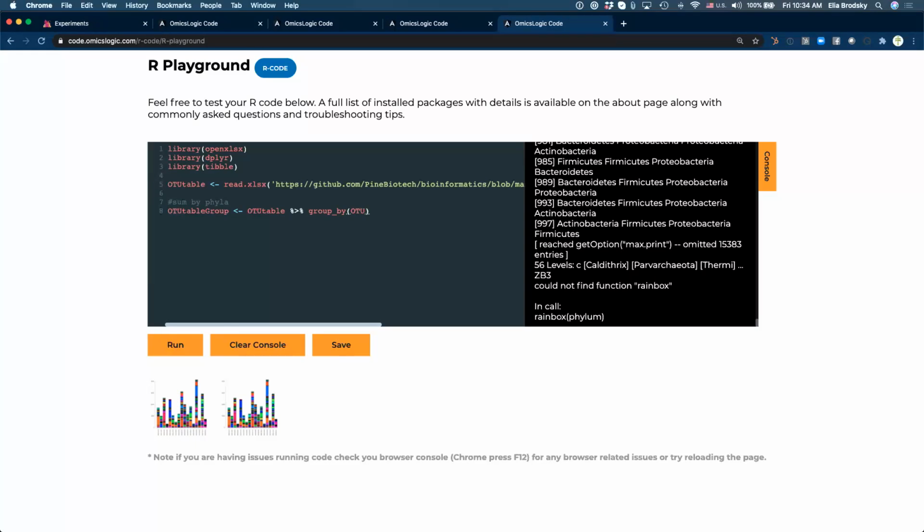And we can also summarize all. We're just going to make everything go a little bit faster. All right, great, Gregory. Now we're going to make it summarize all, and we can use a sum. So we want to just sum the table by different phyla. Okay, so let's do this, and we will also make sure that our row names are back in this OTU. Oh, what did I do?